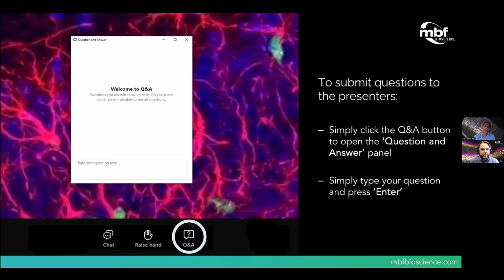Typically what I'll do when I'm setting up something like a mouse brain on the slice is I'll go towards the top of the sample, maybe not the very top of the sample, and I'll put a focus point there, and then I'll go down towards the bottom of the sample in Z, and I'll make that in focus as well. I'll add both of those points to my map, and I'll see how my interpolation looks at that point.